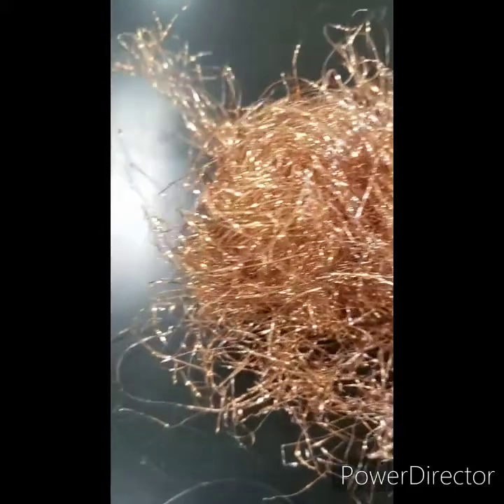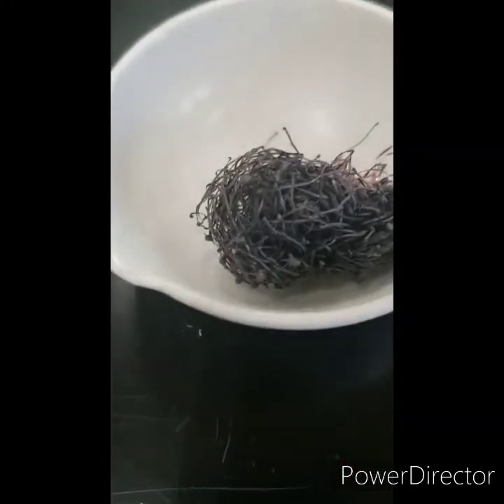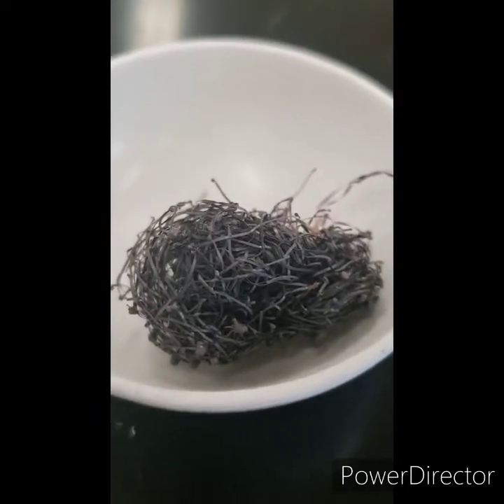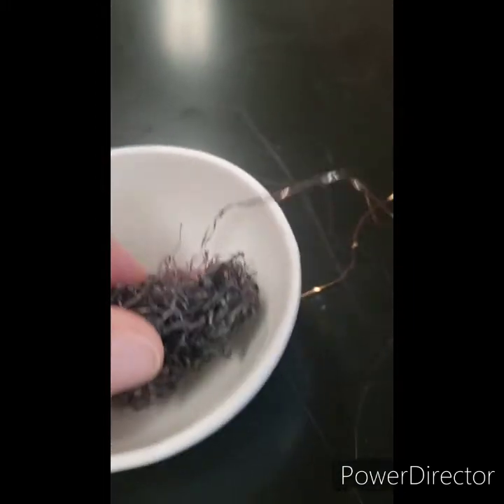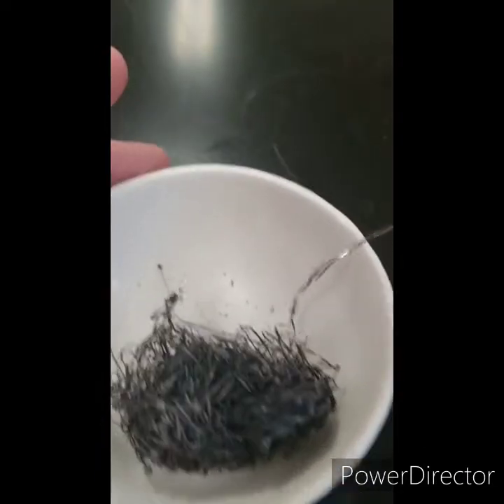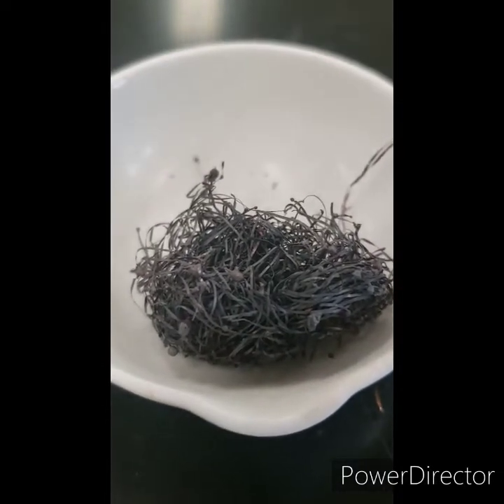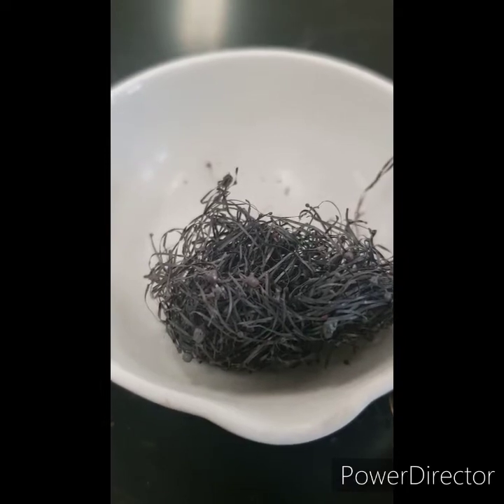Now let's look at the properties after heating. I've put our piece of copper in this evaporating dish. It's black instead of metallic orange. It's brittle — see the pieces coming off? And it's no longer shiny; it's now dull. So we've transformed this copper. Let's see how.